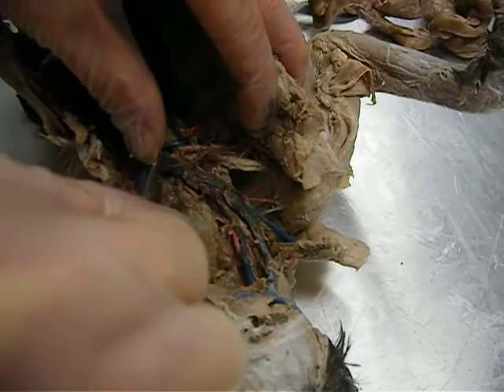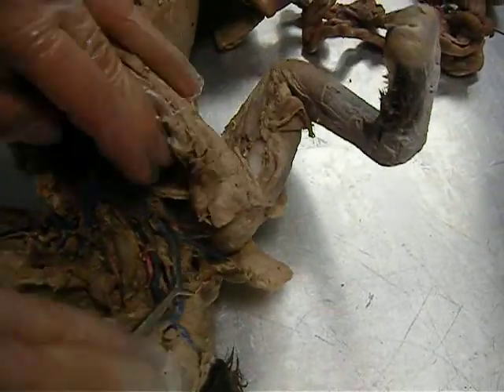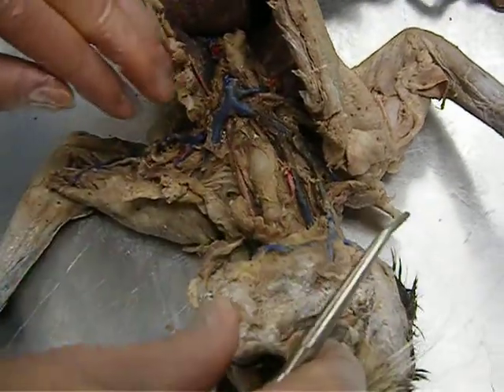Going up the side of the neck is the external jugular and the internal jugular veins. This one going across is called the cephalic vein. Come up here and there's three branches: posterior facial, anterior facial, transverse jugular.